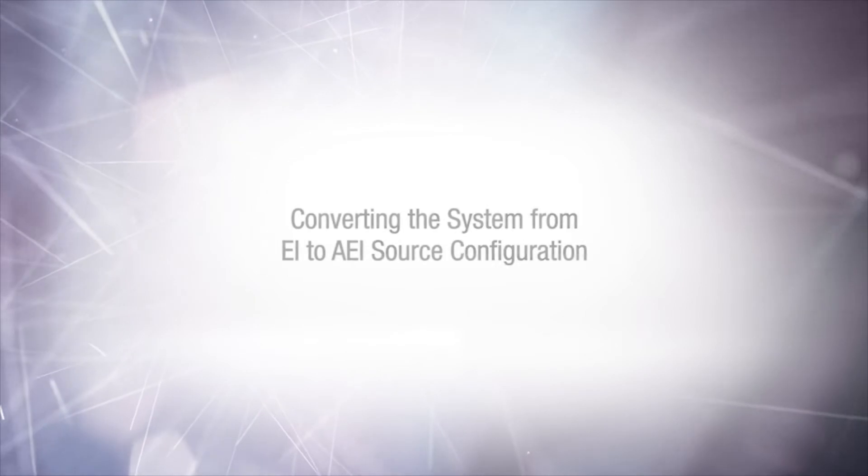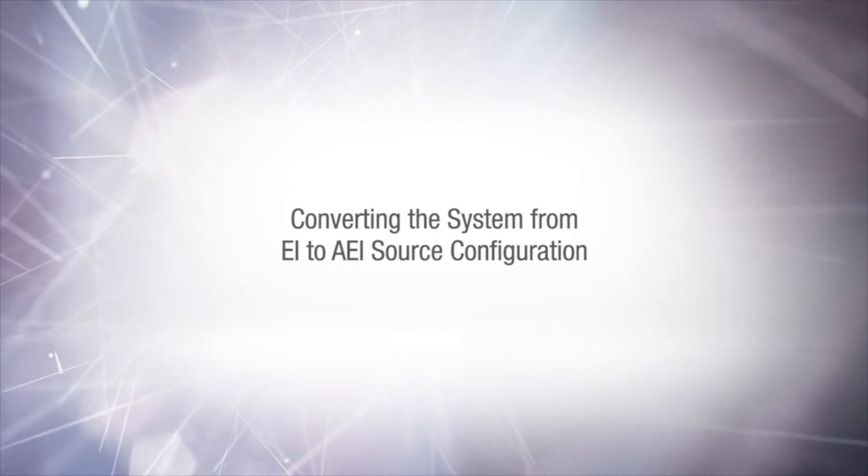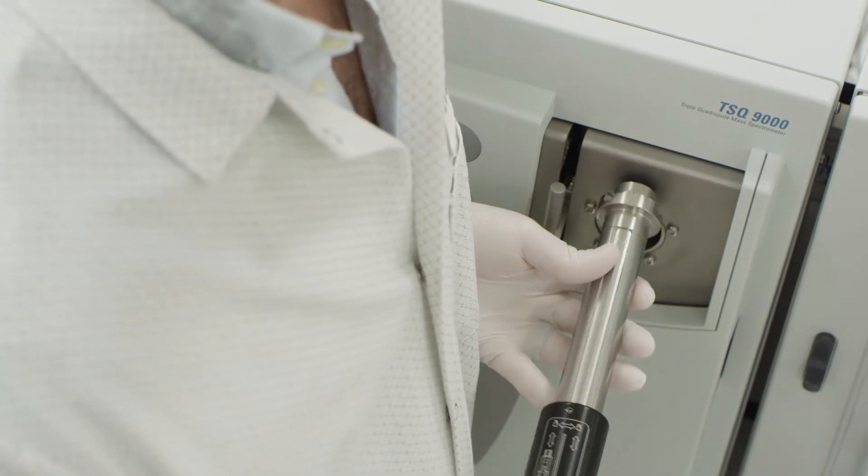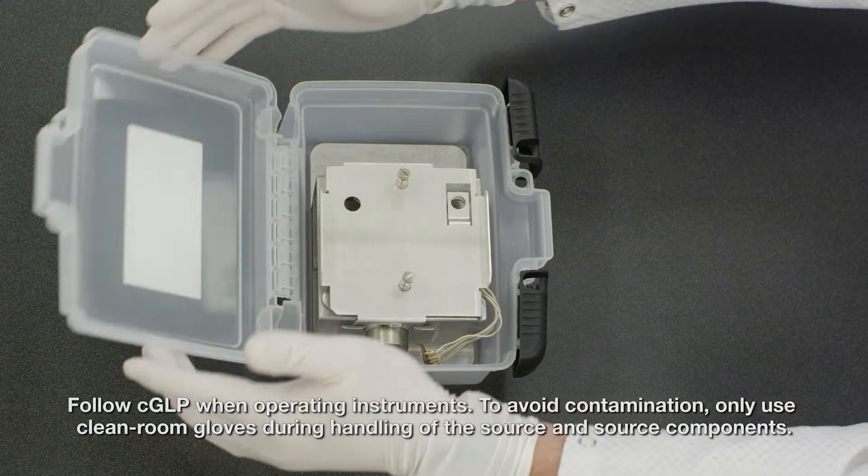In this portion of the video, we'll be converting the system from EI to AEI source configuration. To begin, remove the EI source using the instructions located in the hardware manual and store the source in the source kit box.